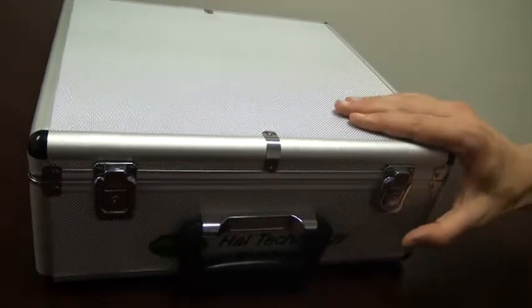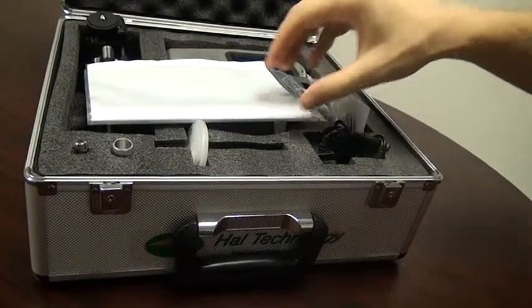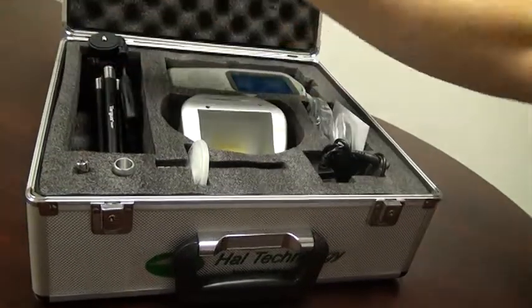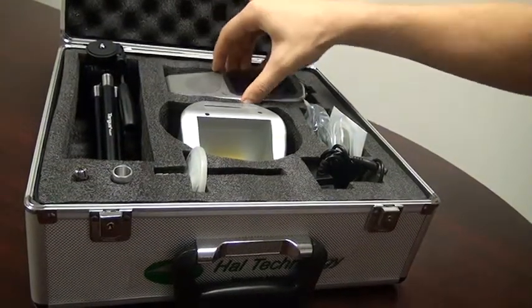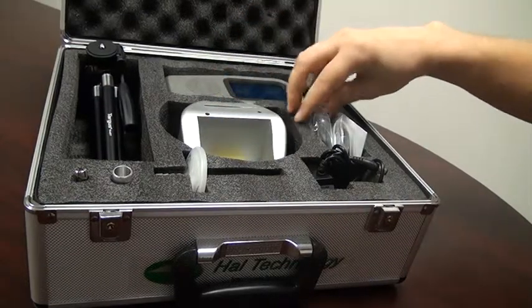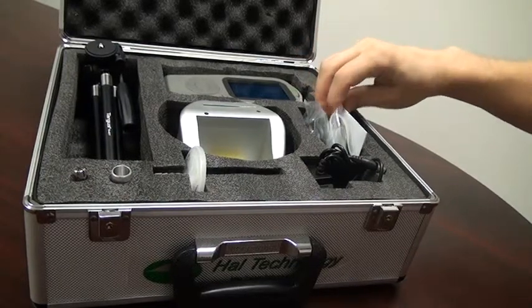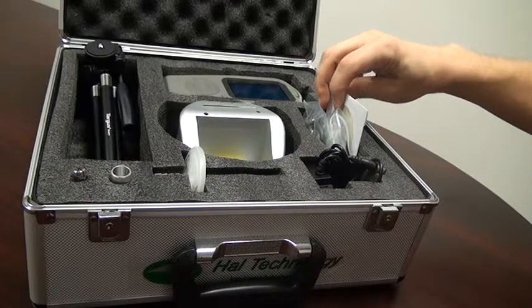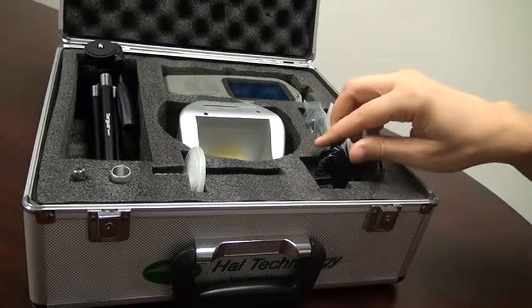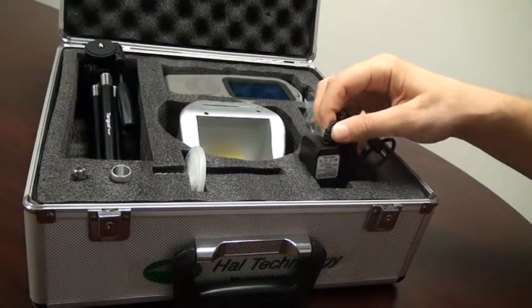When you receive the unit, it comes in this case. Inside the case, we can see all of the accessories: the calibration certificate, the handset itself, the cradle base, the USB cable to download data to the computer, and the CD with software to be installed on the computer for downloading of data and remote USB operation, and the universal adapter to charge the battery or for continuous operation of the counter.